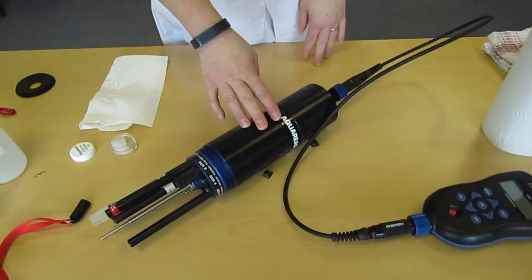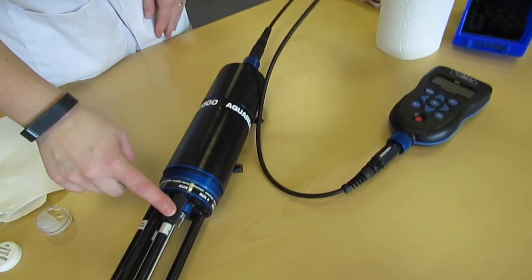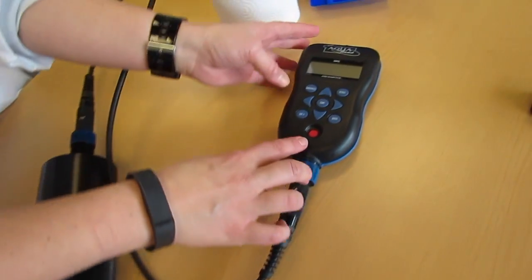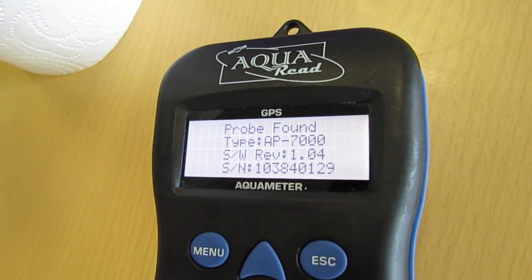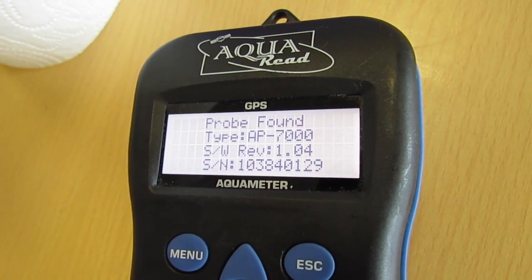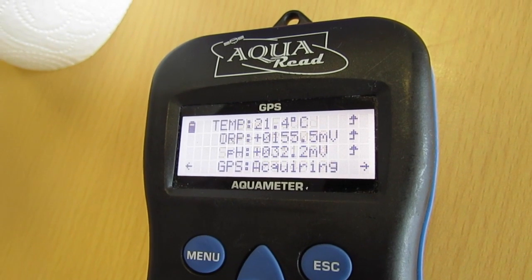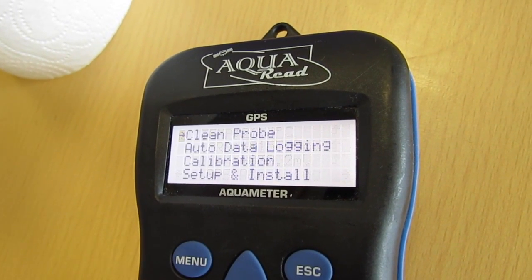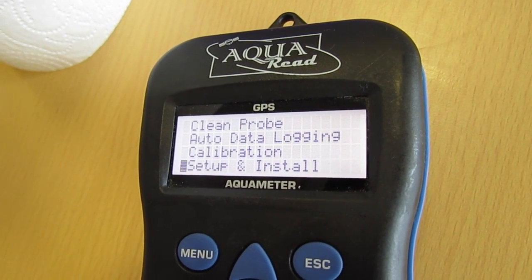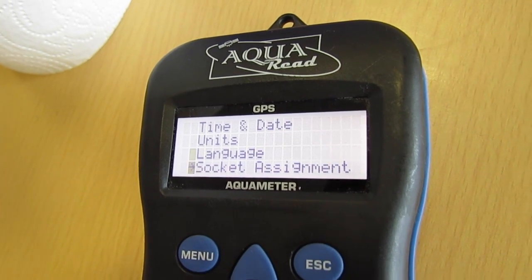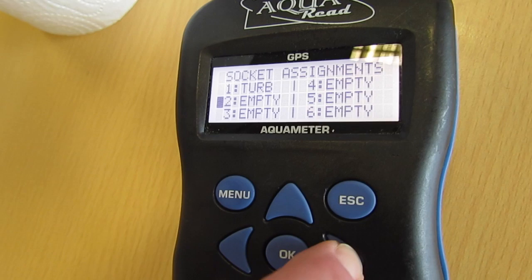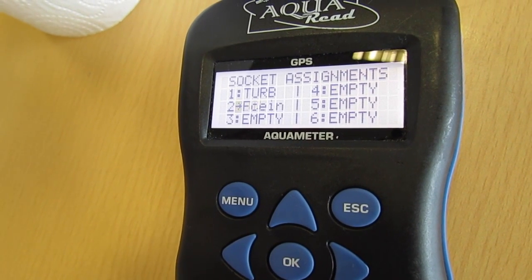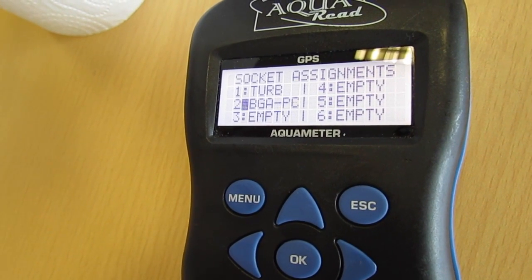The probe now needs to be told that this electrode is installed in aux 2. Turn on the meter, press the menu button, scroll down to setup and install, socket assignment, and as it's in aux 2, scroll down to fluoride, which is the IESC I've just installed.